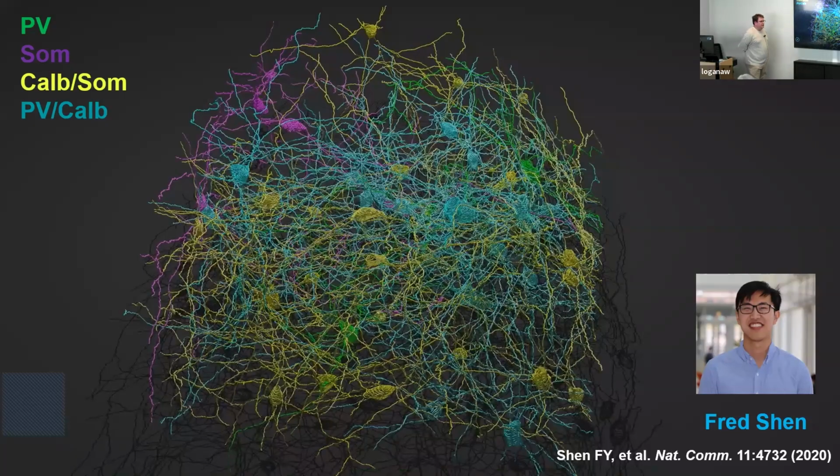So they are stitched together in multiple dimensions. It's kind of like you have your microscope, and first you scan in X and Y, and then you shift everything up a little bit. Then you take another image in X and Y, and then you repeat the process, right? Because you can imagine there's a bunch of little squares that get collected. All of those get stitched together, right?